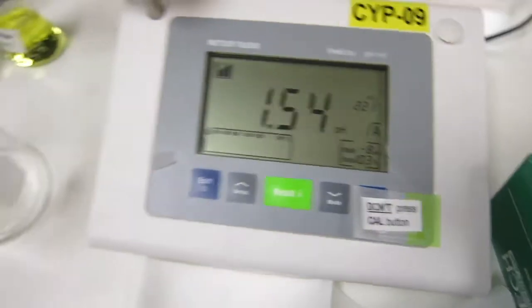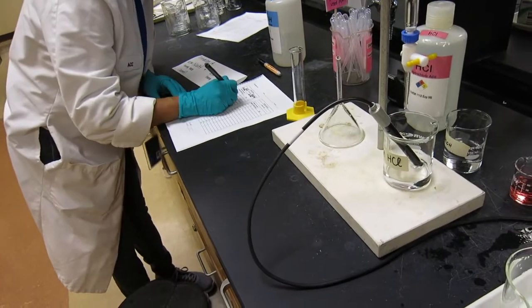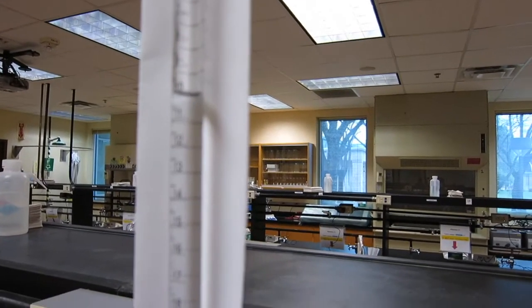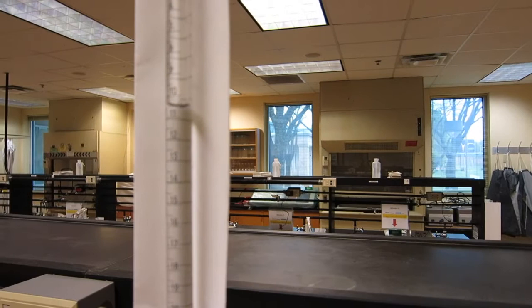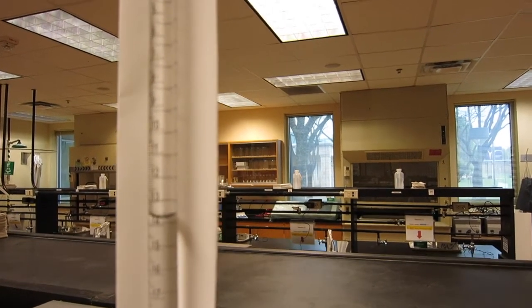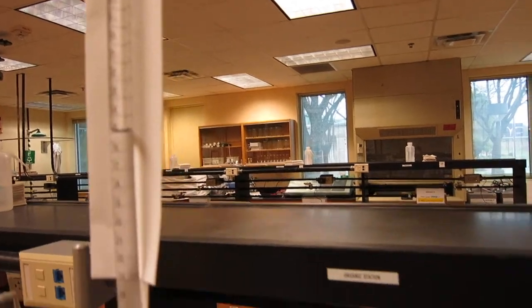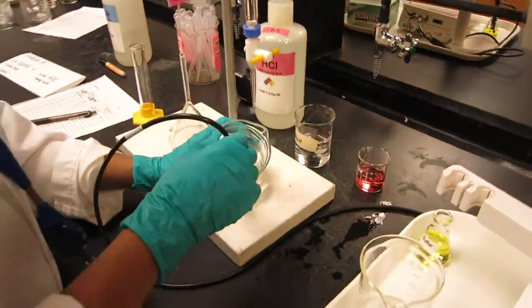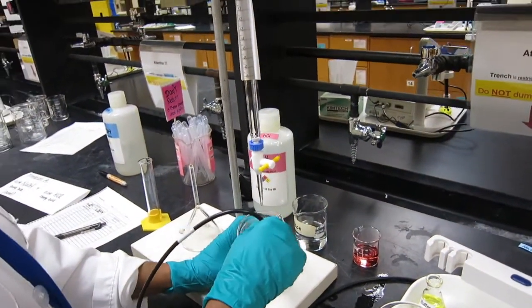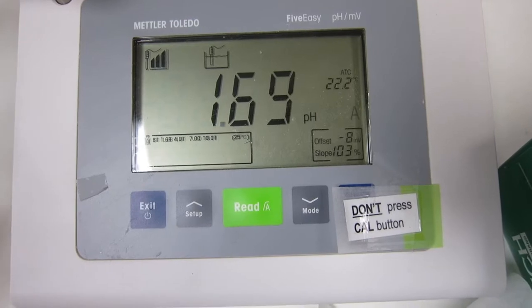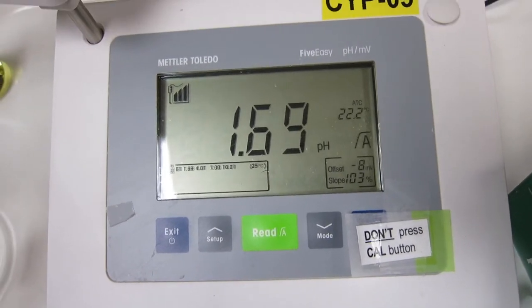It's 1.54. There we go, perfect. Total of 15 mL in the beaker, 15 mL NaOH and 25 mL HCl. Let's read this, keep swirling. It's 1.69. Write it down.